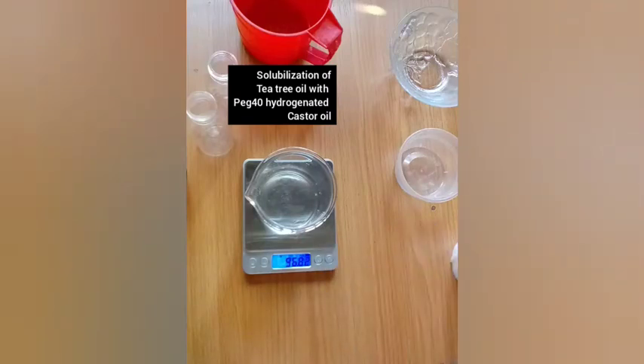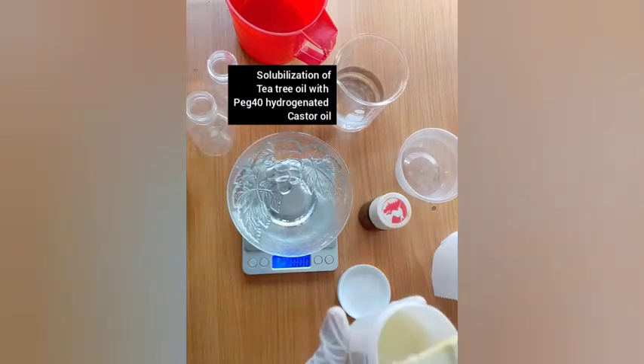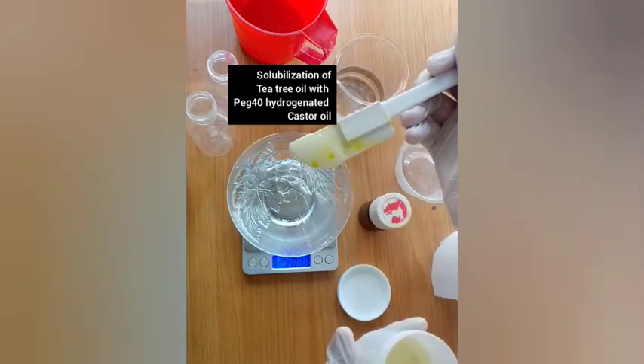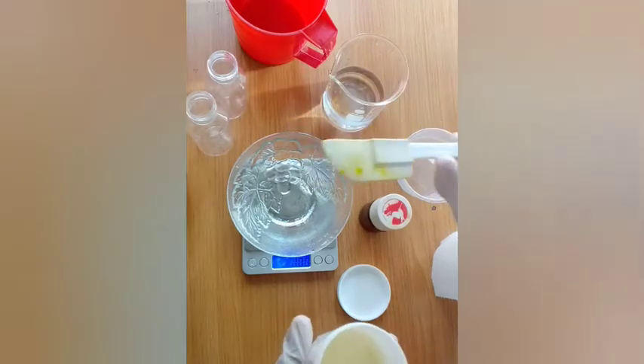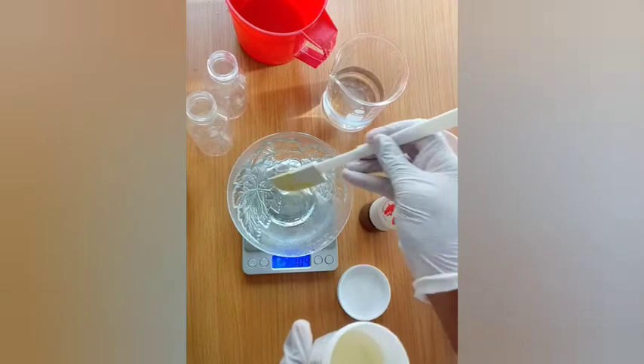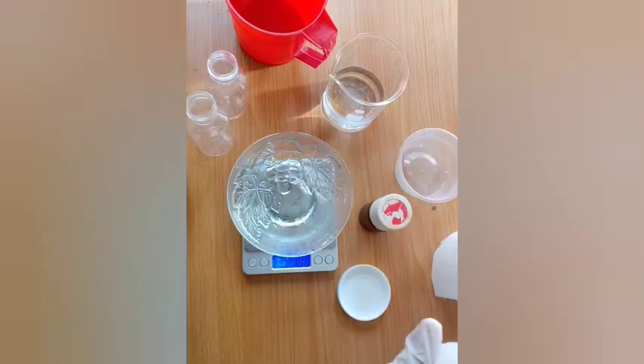Here I have my solution — I'm basically weighing out my PEG-40 hydrogenated castor oil at a ratio of four to one.